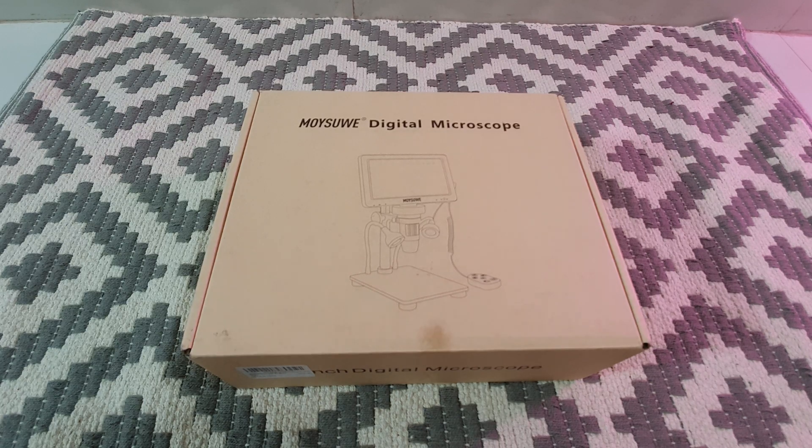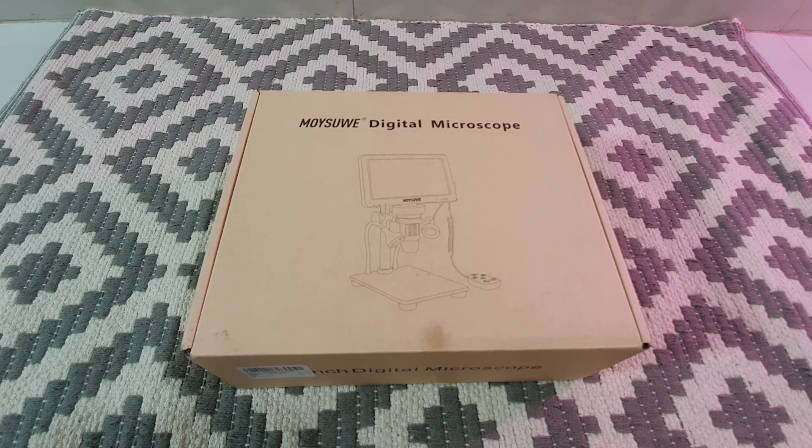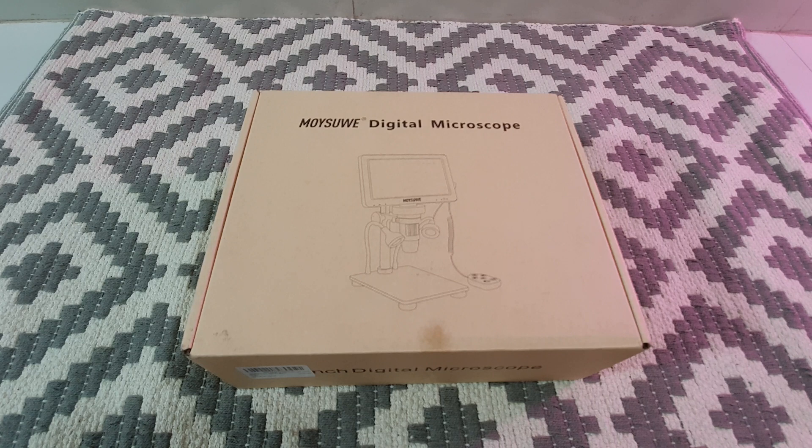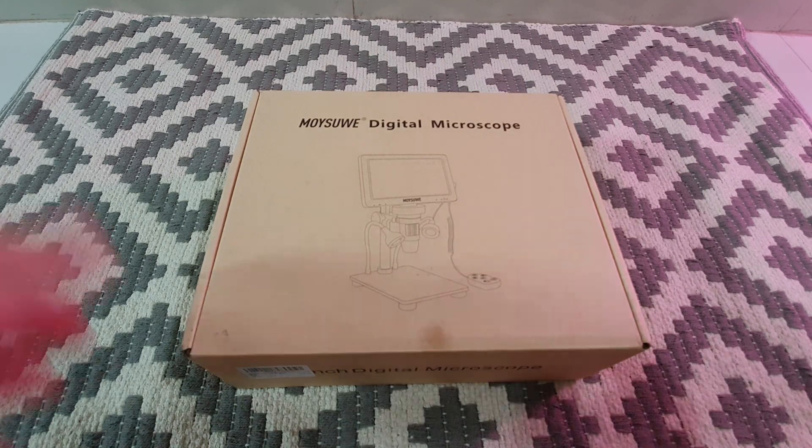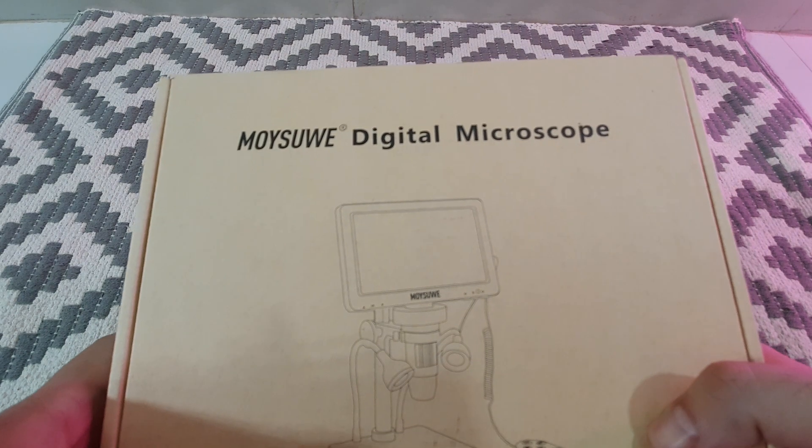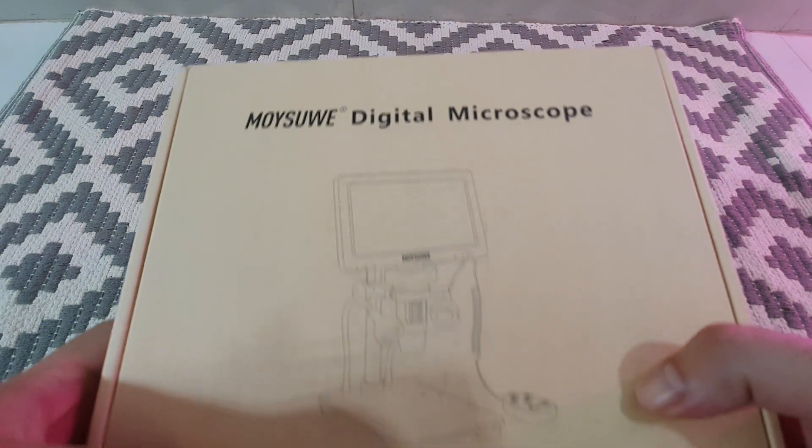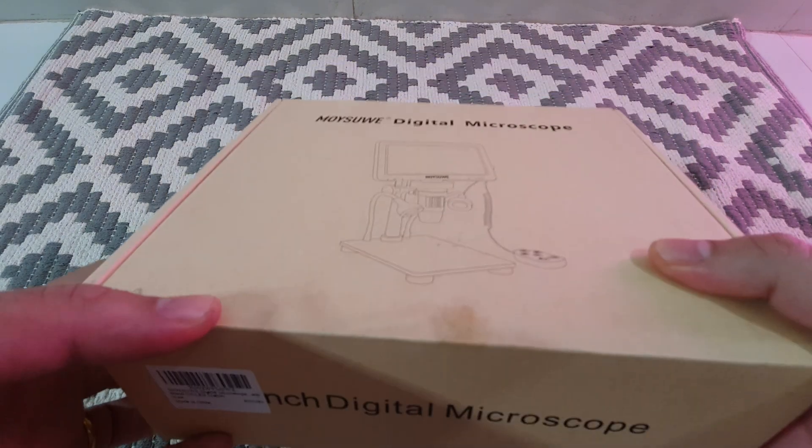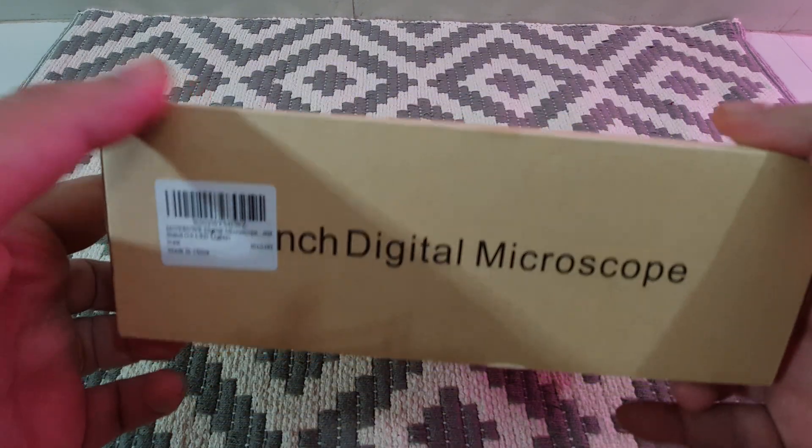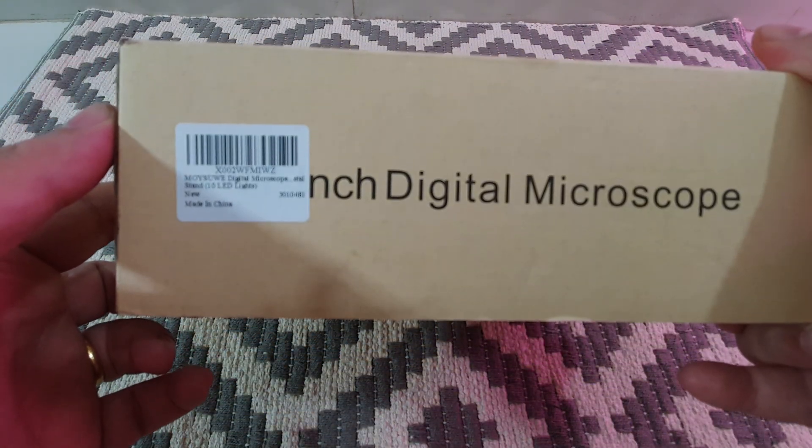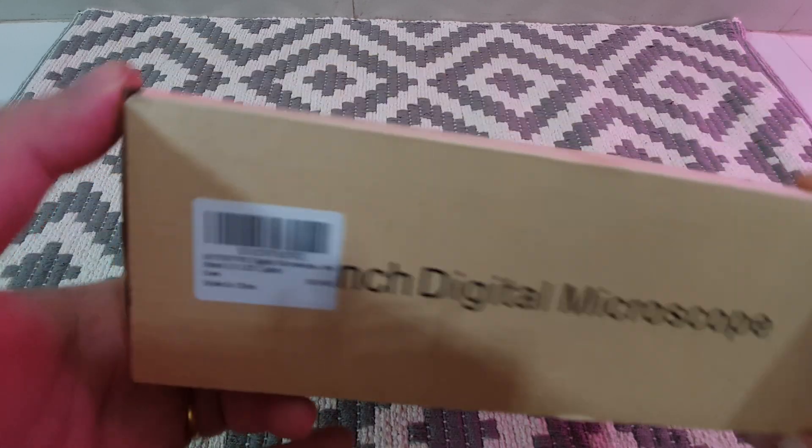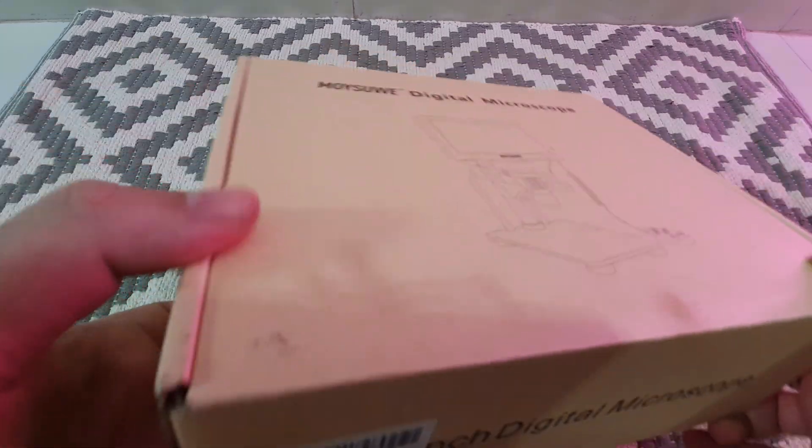Packaging has been very simple these days. This one comes in a plain cardboard box, eco-friendly packaging. Pretty sturdy packaging. It just says Moisoovay digital microscope.